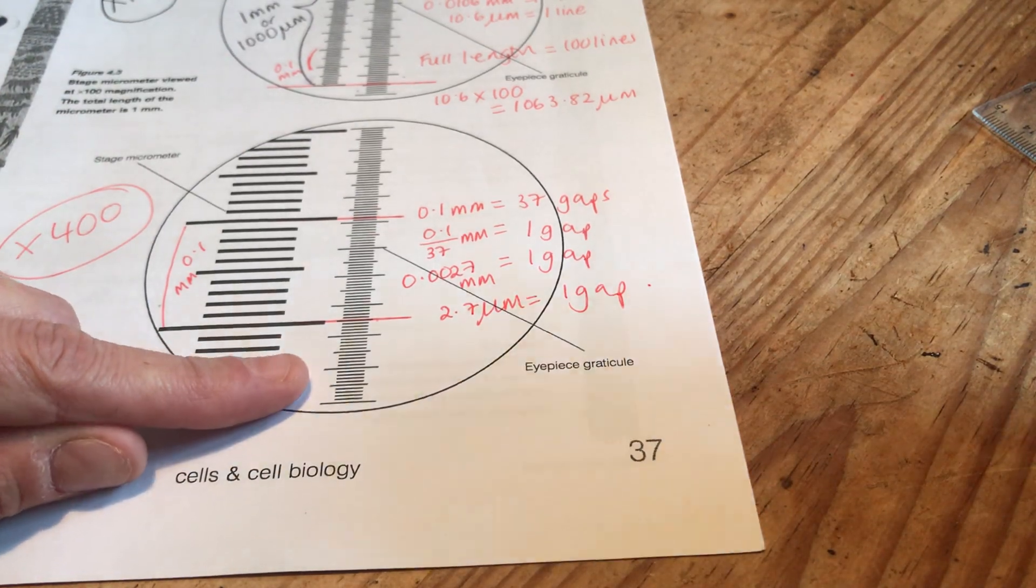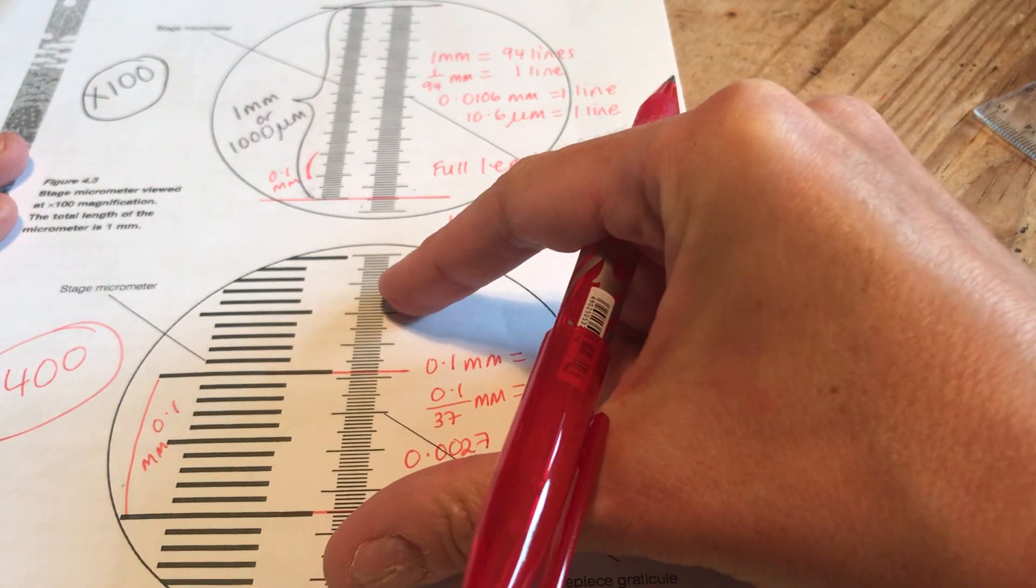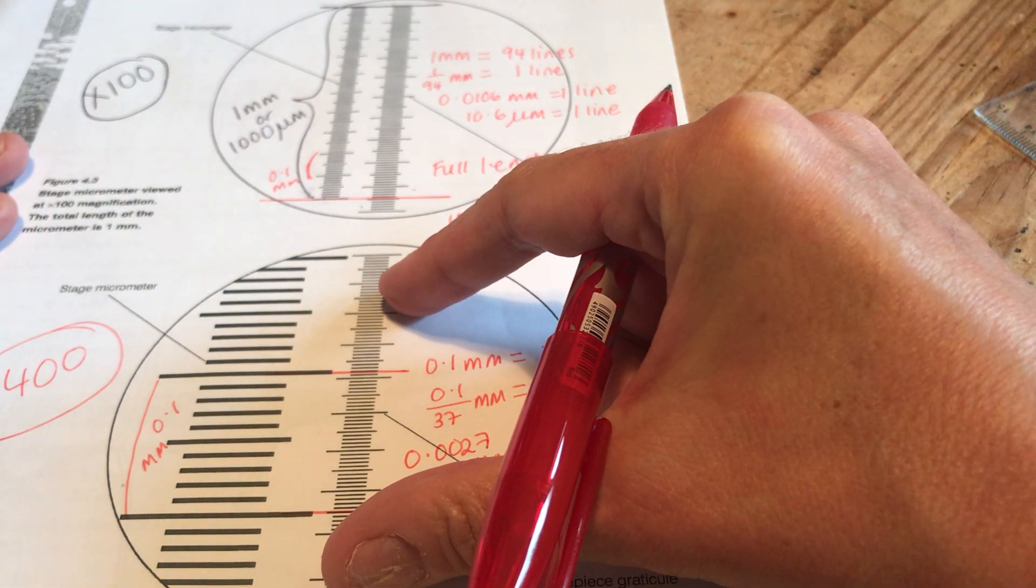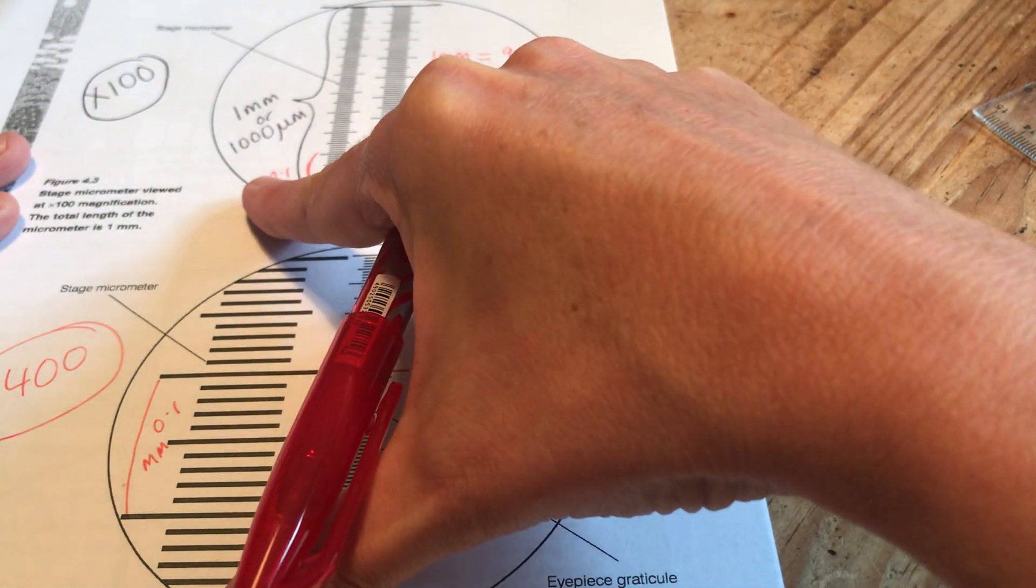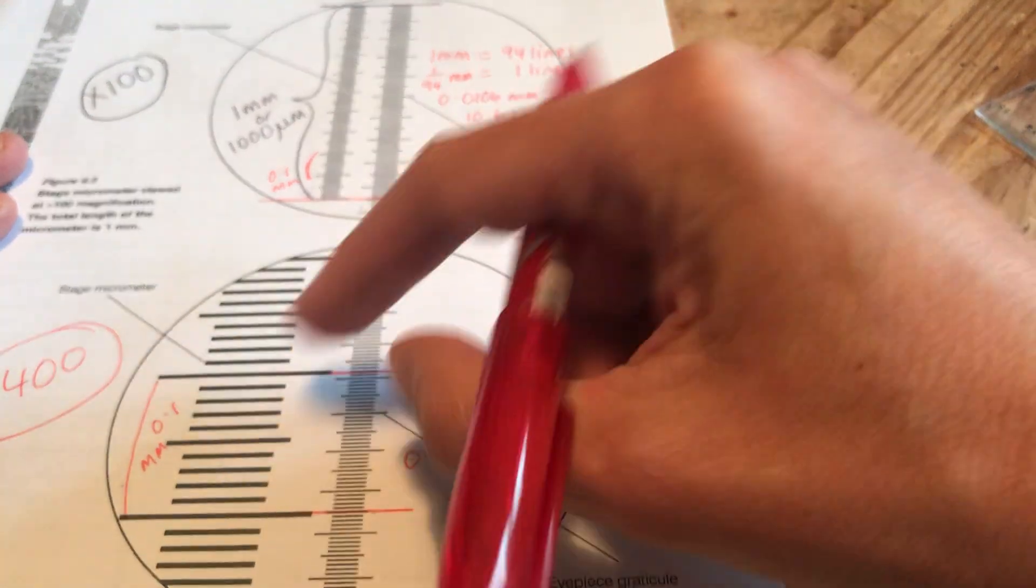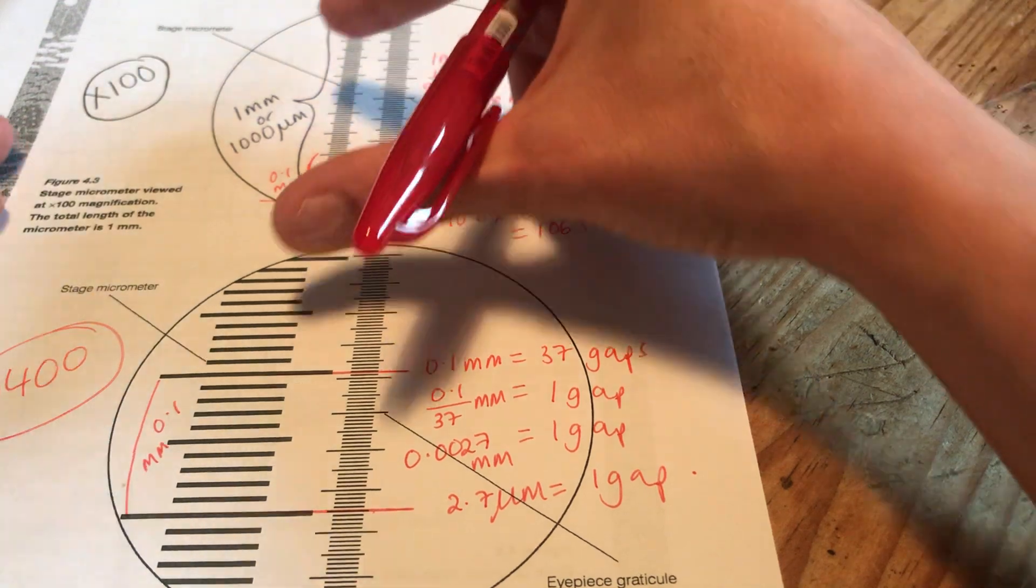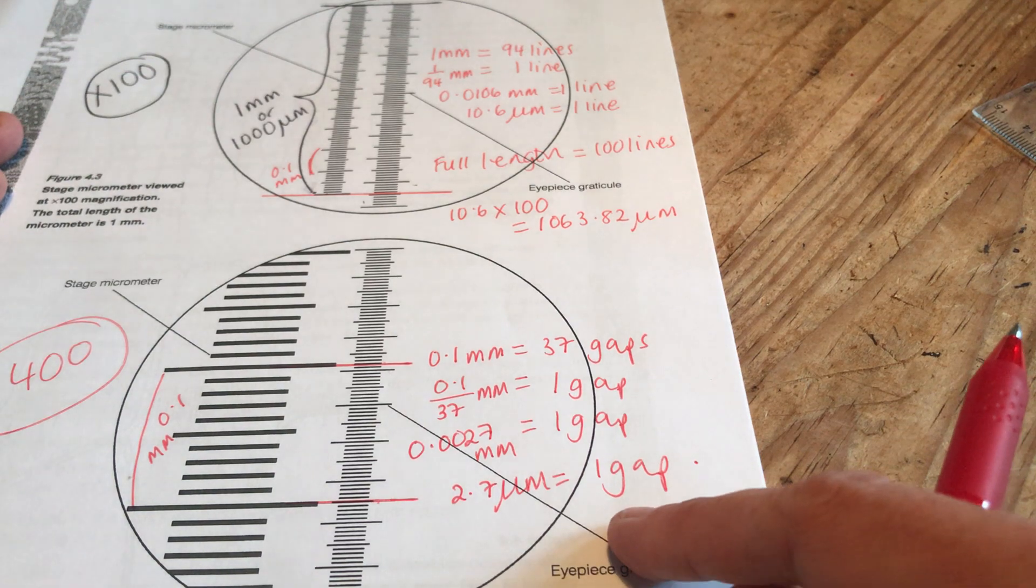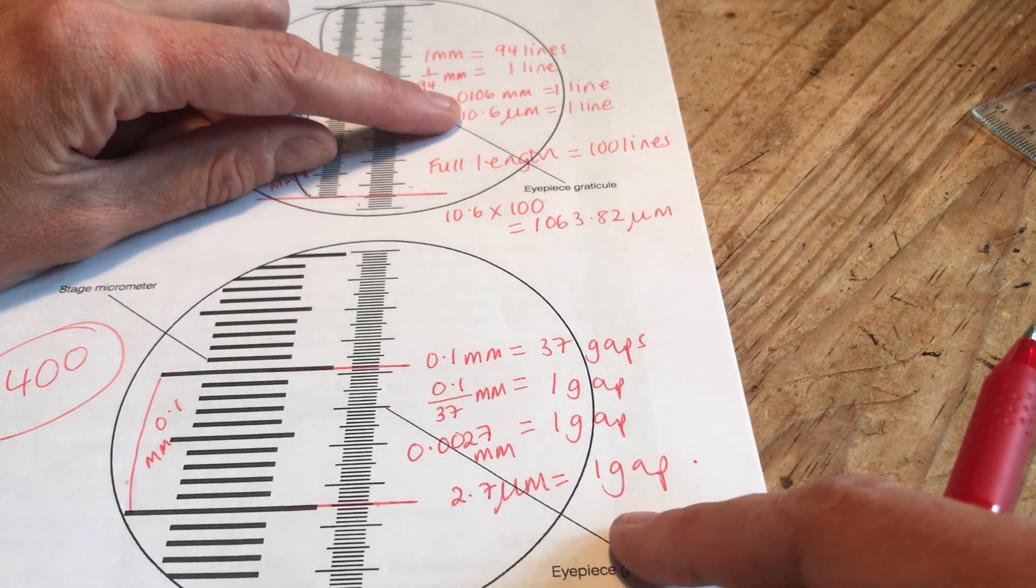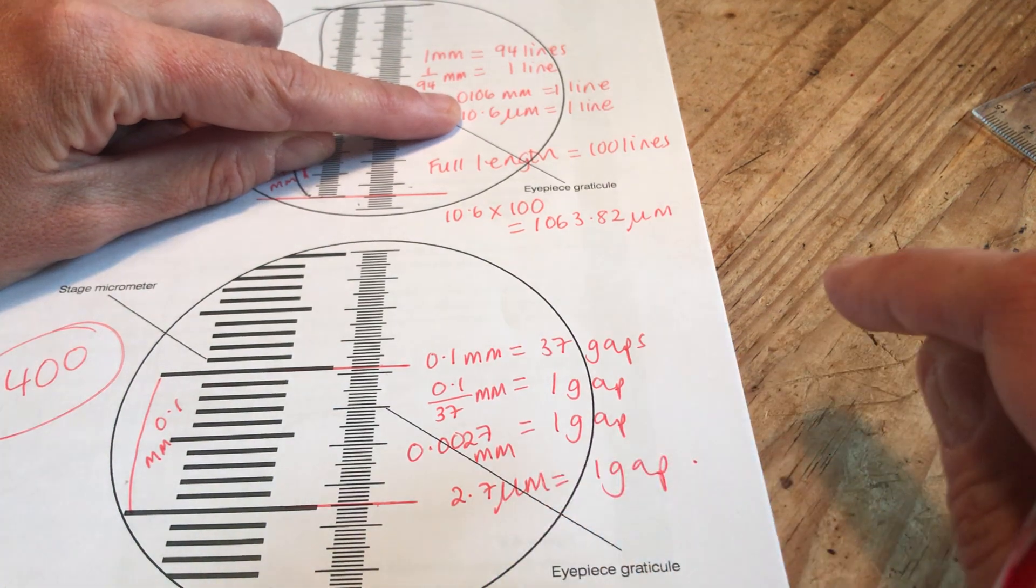So remember the eyepiece graticule always stays the same. It looks the same when you look down the microscope. But as you zoom in on a magnification, you get more and more magnification on the stage micrometer. You're seeing less of it. So before you could see the whole one millimetre. When you zoom in, you can see less. So each gap now, we had one gap here worth 10.6 micrometres. Now my gap is worth much less, 2.7 micrometres. So we were on question three, I think, weren't we? So we've done that one.